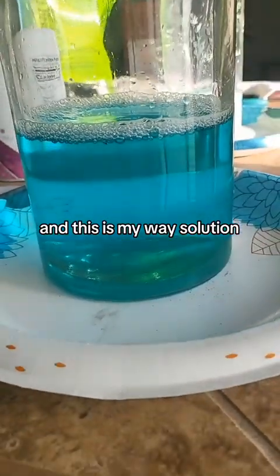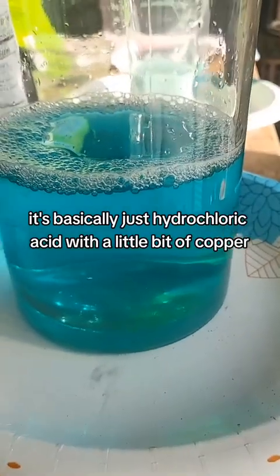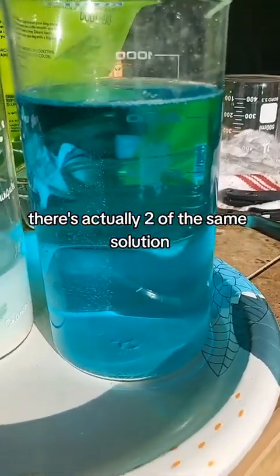This is my waste solution — it actually is still good. It's basically just hydrochloric acid with a little bit of copper in it. There are actually two of the same solution.